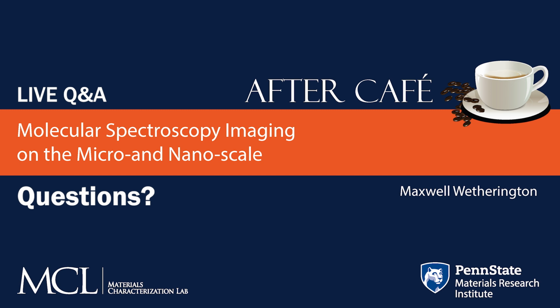Okay. Well, infrared spectroscopy and Raman spectroscopy have been around for a while, and there are databases available for those techniques. The nice thing about Nano-IR is that in most cases, I'm not sure this is exactly the question you're asking, but the IR response is very comparable in the Nano-IR as it is in the far-field IR.